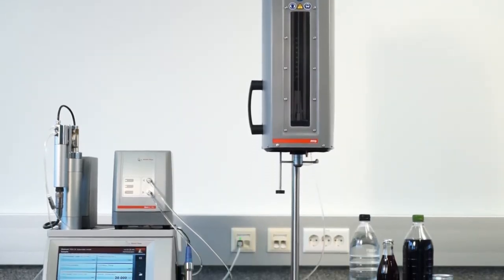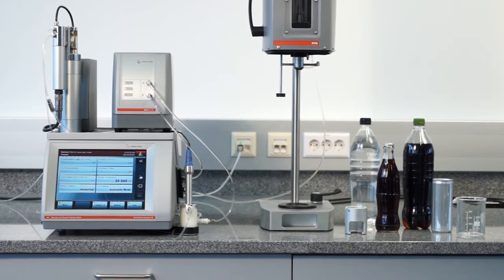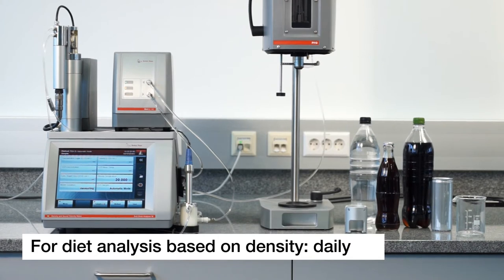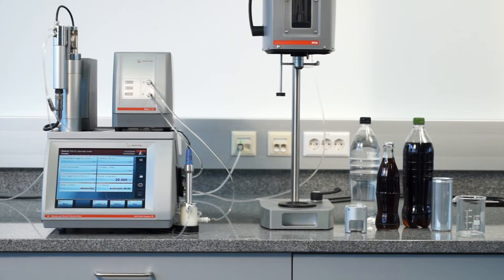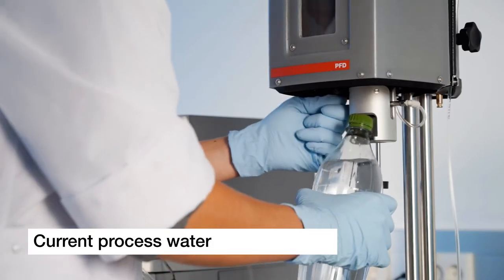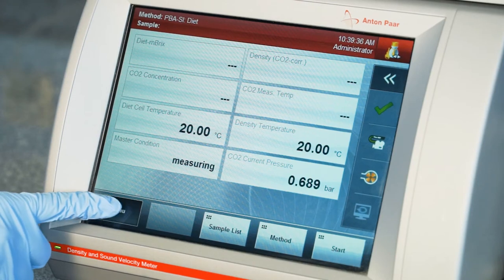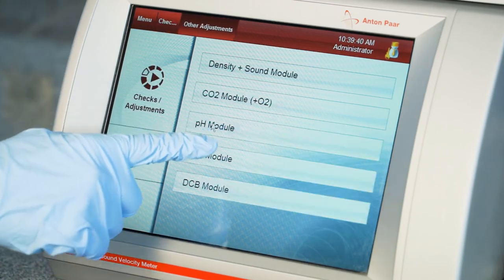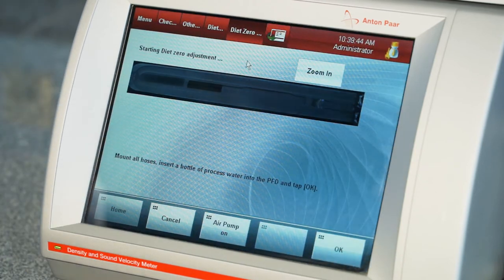Maintain the performance of your optical diet analysis by performing a diet zero adjustment on a weekly basis. In case diet analysis is done via density, perform a diet zero adjustment every day in the morning, or before starting the routine analysis before each shift. To do so, use the current process water and activate the sample transfer. Select menu, checks/adjustments, other adjustments, diet module, diet zero adjustment, and follow the instructions on the screen.